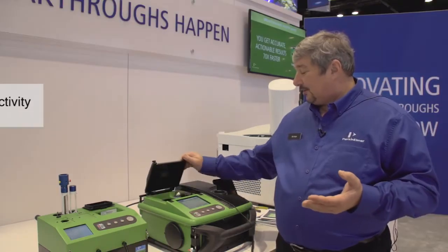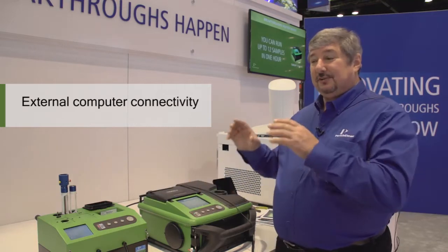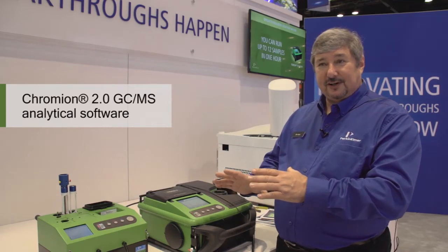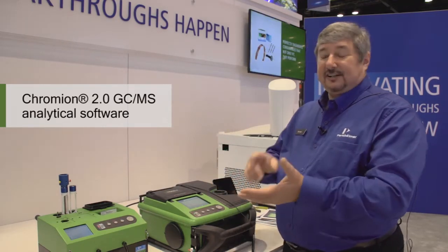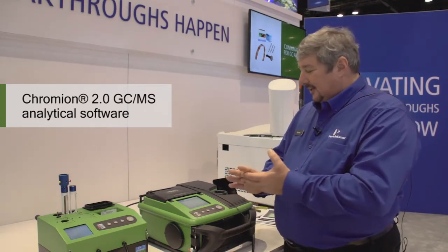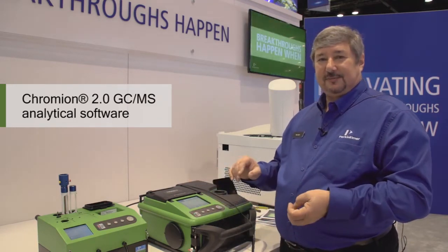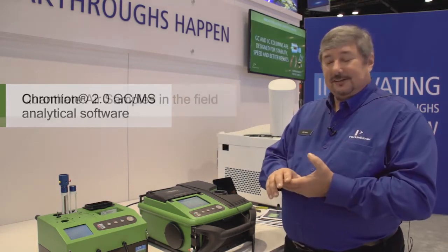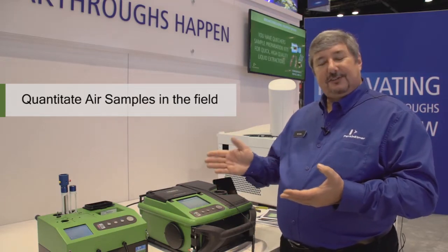It has an onboard computer that allows me to get my results in the field. I can hook it up to a laptop computer, and we have our Chromion software that allows me to crunch the data. I can search the NIST library for matches, and I can put together my own special libraries to go into the system and tag certain chemicals that I want or don't want to see. So it makes it easy to do quantitation in the field for air samples.